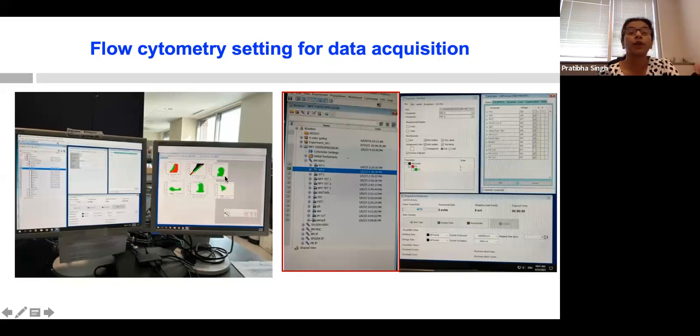It means that when we put the samples here, the cells should be above 0 on both sides, x and y axis, but they should not go outside the plot area. I will explain this later with a figure. But that's the way we start.